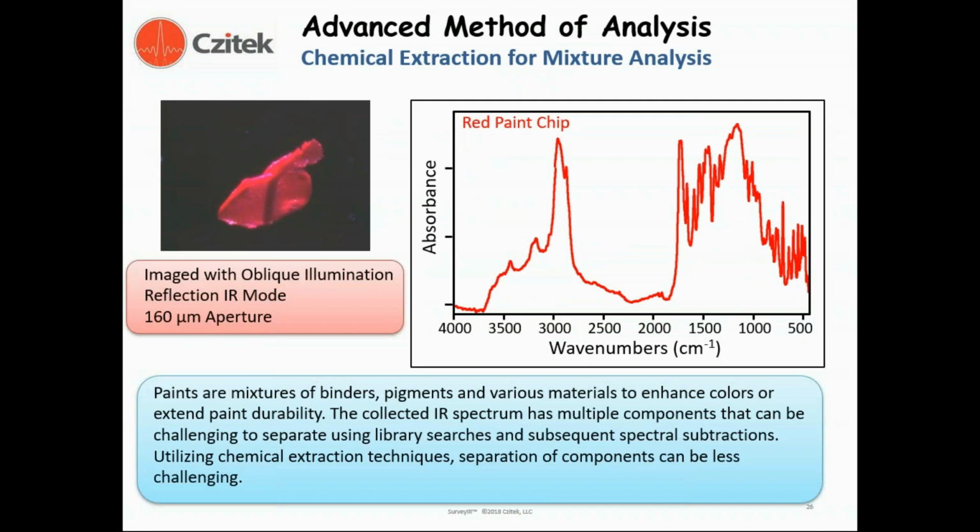So lastly, we're going to show you an example of a relatively simple sample in terms of observation, but fairly complex sample analysis, and that's the paint chip.